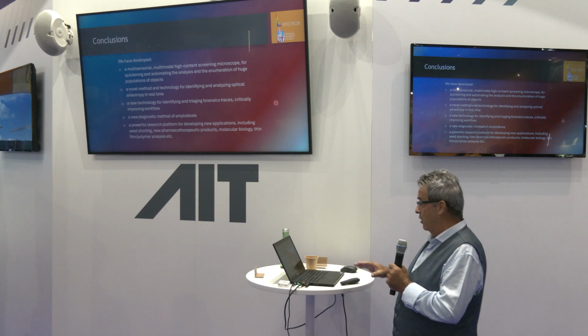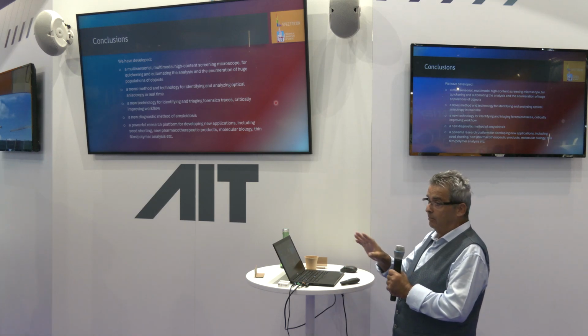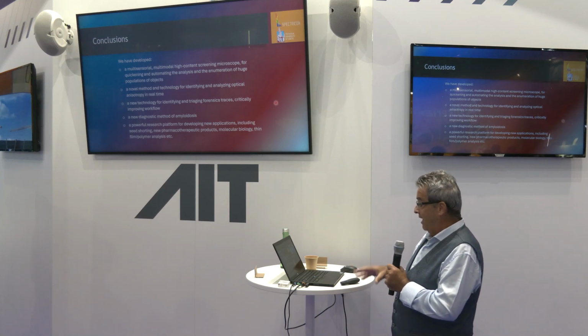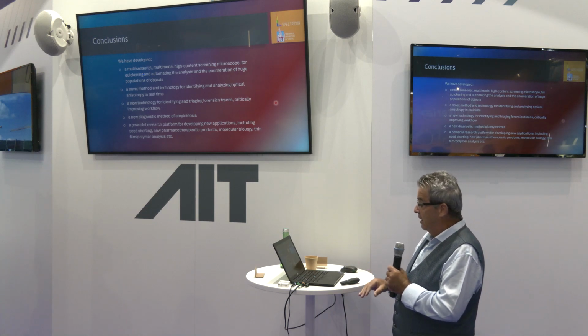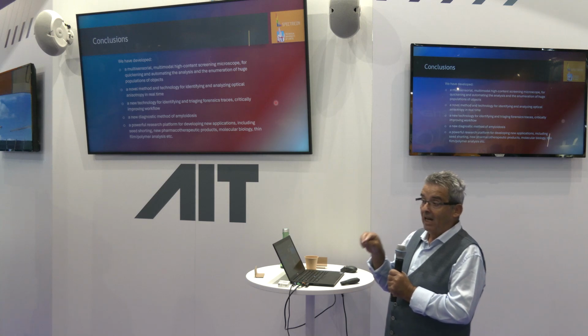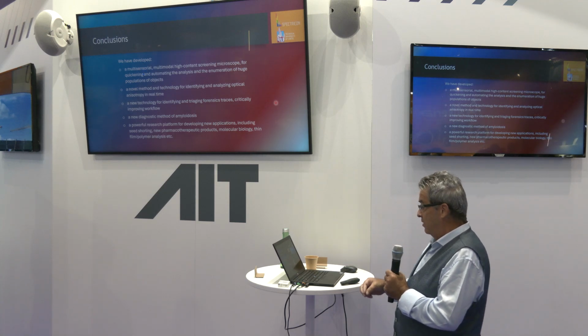Coming to the conclusions, we have developed a multisensorial, multimodal, high-content screening microscope for quickening and automating the analysis in a variety of fields. We have a new method and technology to analyze optical anisotropy in real time and integrate it into the same system.